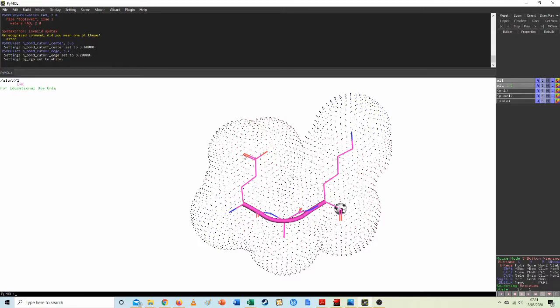Now, if you see where the electrons are, I couldn't, in reality, force these any closer than this. So this is the actual shape it would take up, and the positive charge here and the negative charge here has folded this molecule up, but they can't fold any closer together because we're now getting interaction between the aliphatic CH chains.